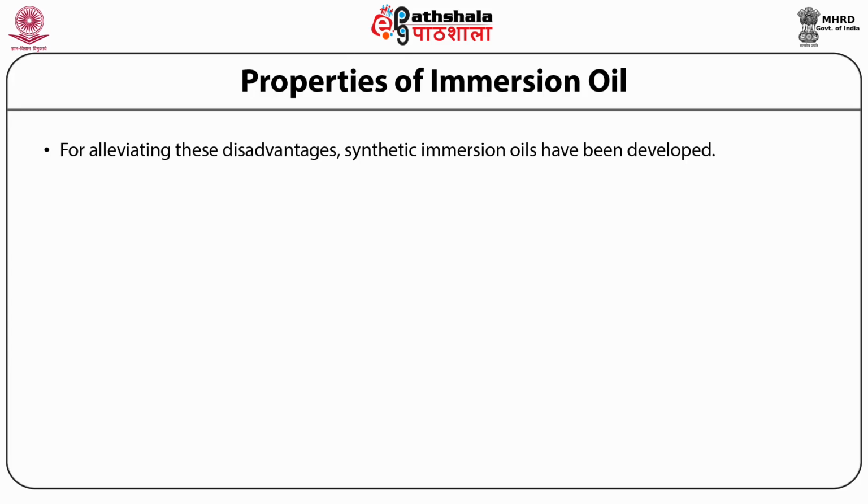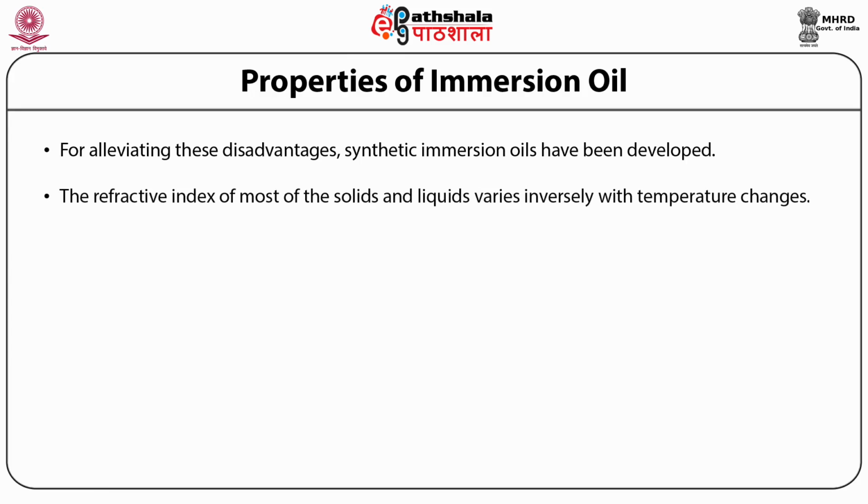Another factor which impacts the performance of immersion oil is the temperature. The refractive index of most solids and liquids varies inversely with changes in temperature. Thus, the packaging indicates the temperature at which the oil has been adjusted.